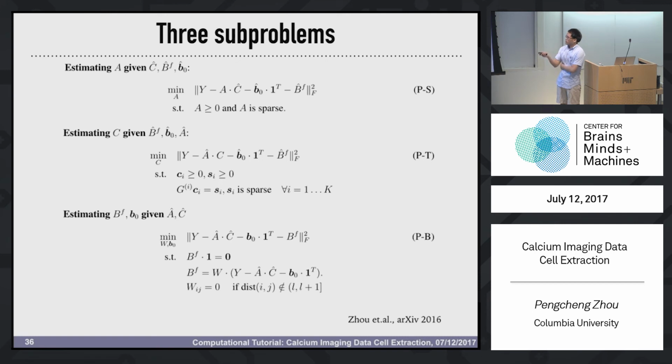When we subtract the neural signal of all these segments, they are not here anymore. I mean, the neural signal has been subtracted. So in your estimation of B, it won't be a problem in that case. I will talk with you later.